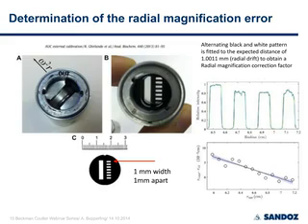So you use 3mm ring spacers and the calibration mask just like a flat centerpiece, and what you record is the alternating black and white pattern. You know it's 1 millimeter black, 1 millimeter white, and you compare the pattern to the measured one and can derive a radial magnification correction factor.